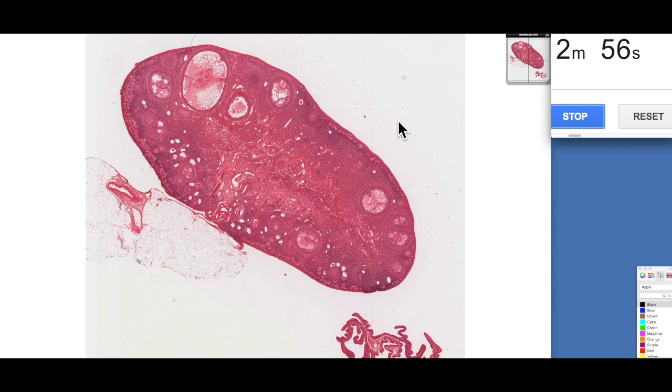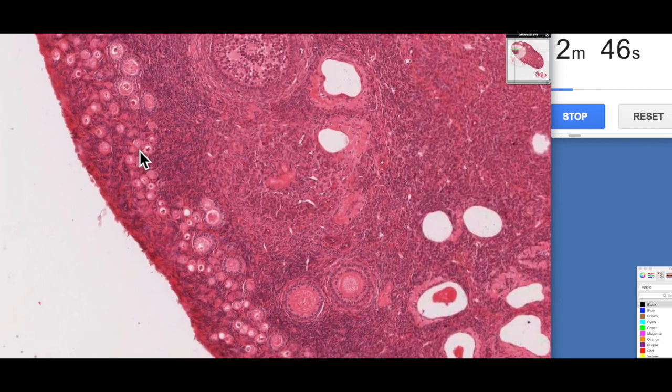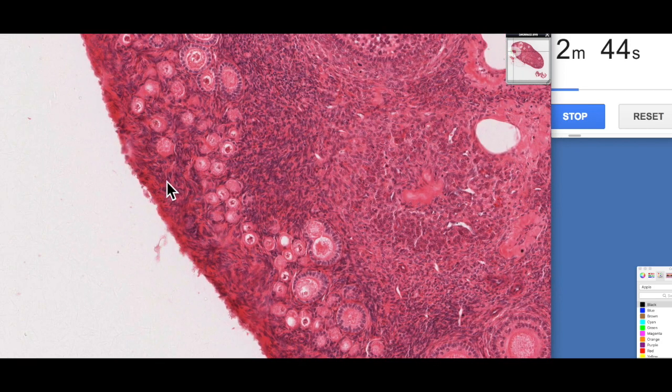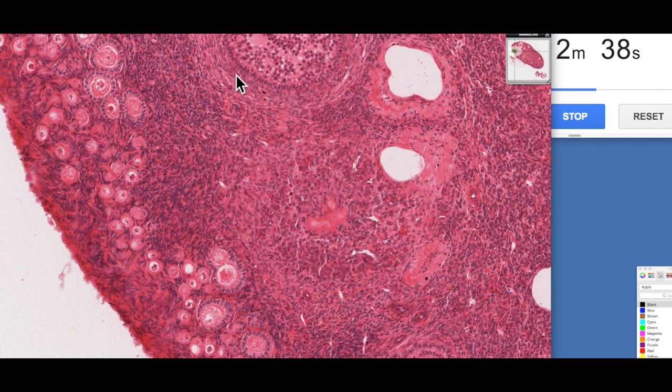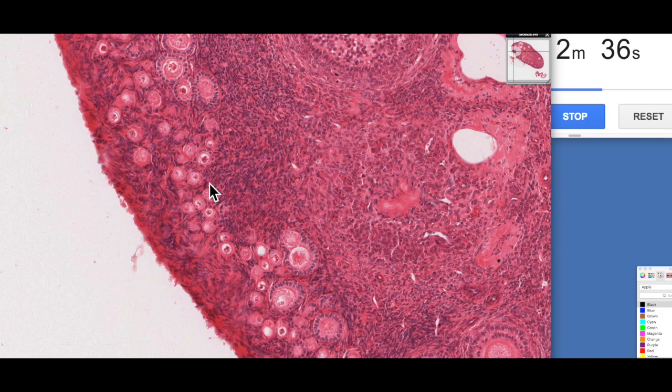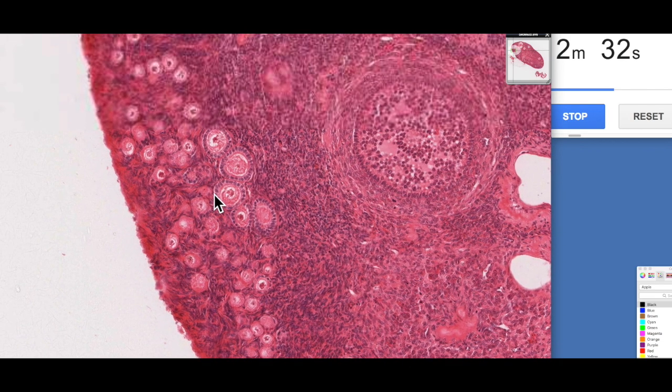So the store of follicles within a woman's ovary, immediately after she's born, are a type of follicle known as the primordial follicle. These are the follicles which are stored particularly on the outer part of the cortex. So this is the ovarian cortex where we find the follicles at various stages of development. And so these are all primordial follicles.